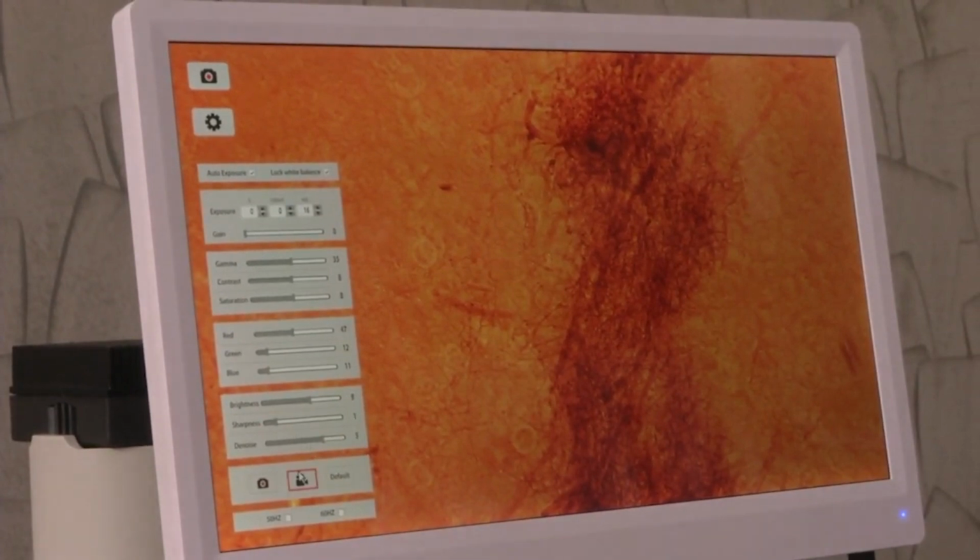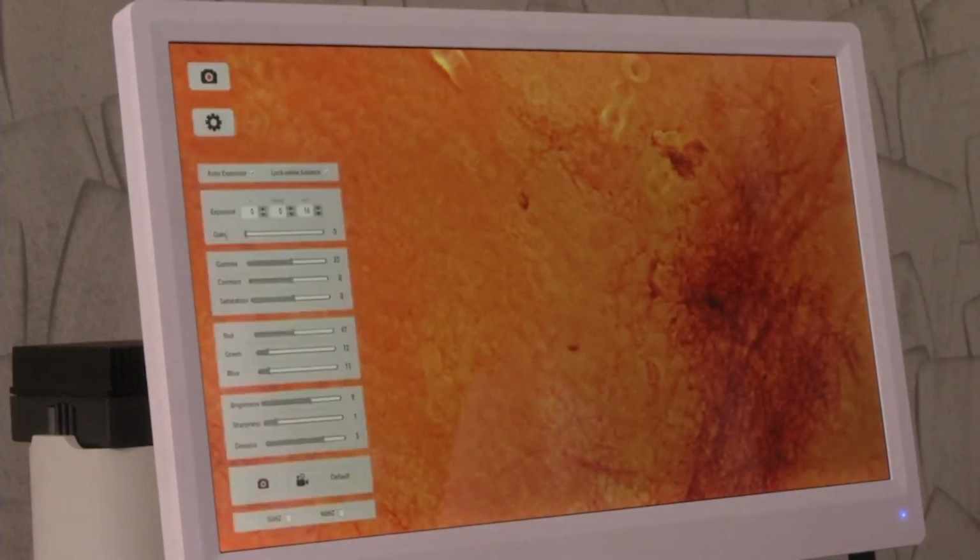Now, you can even take videos with this camera. See, there is an option here, you can either snap this or you can take a video. What happens when you take the video? So, you take a video and then you move the sample around and then you stop it. So, the video is captured, video.avi is captured.